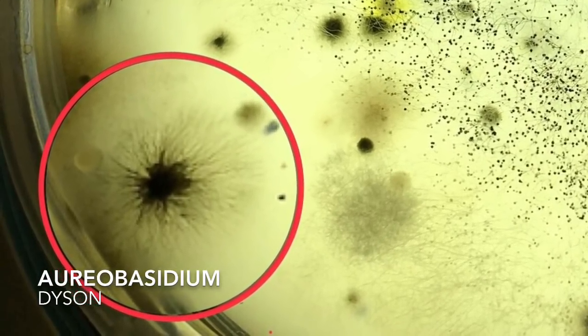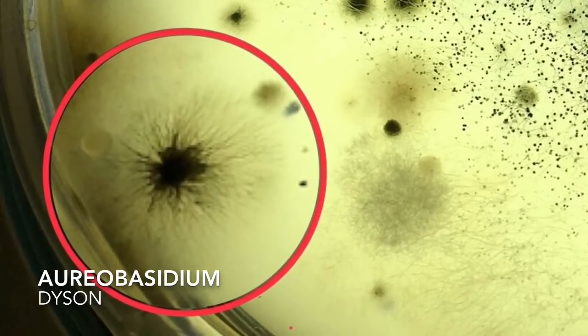The last organism from the Dyson plate is a yeast called Aureobasidium. This is a really interesting fungus because it has both a mycelial phase and a yeast phase.